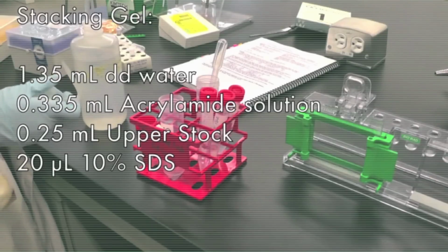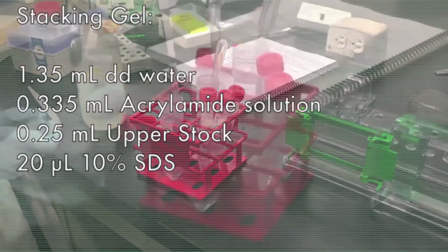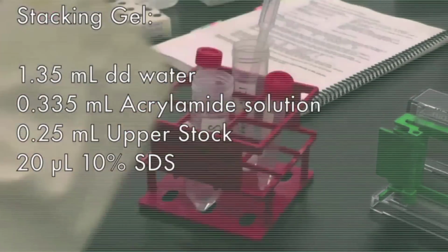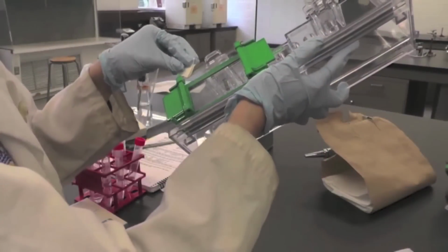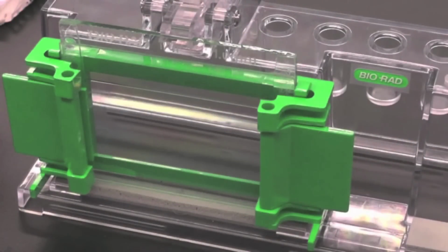While waiting for the resolving gel to polymerize, prepare the stacking gel solution in another 50mL Falcon tube. Mix 1.35mL of DD water, 0.335mL acrylamide stock, 0.25mL upper stock, and 20μL of 10% SDS. Once the resolving gel has formed, which takes roughly 30 minutes, drain the isopropanol. Gently rinse the top of the gel with DD water and dry with Kim wipes.